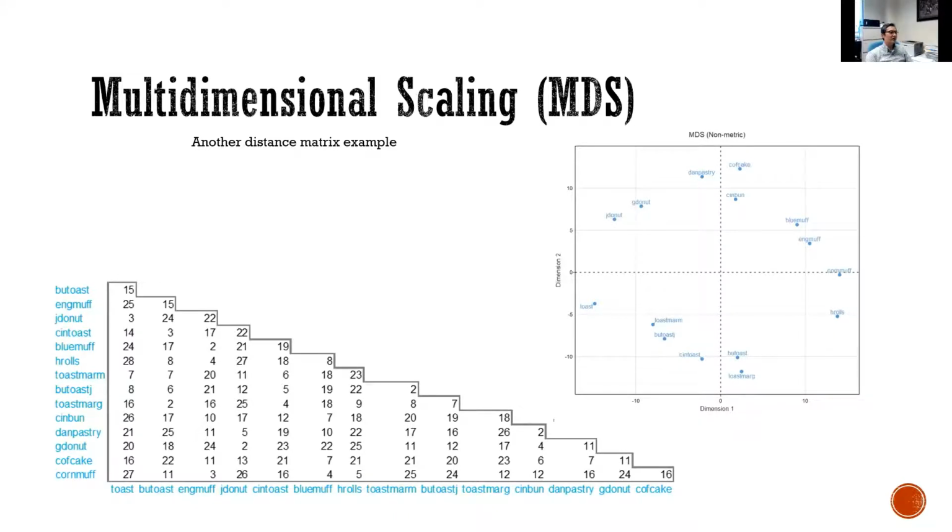Again, this just tells you that you can use multi-dimensional scaling to achieve this analysis. So go back to our single-cell RNA-seq data. Imagine you have this big n by n distance matrix between individual cells. Then you can use MDS to project each individual cell into this two-dimensional space and look at their relative position, and you can then cluster cells into groups.